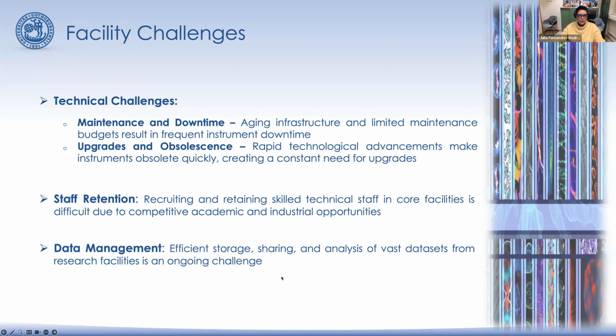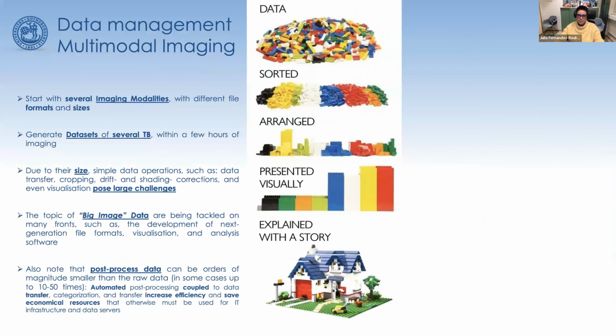Data management, obviously, is the fashionable topic, and it is important for storing, sharing, and analyzing all this data, or big data, that's coming. In my facility, as a multimodal facility, we end up not only with data management for confocal, but with different modalities, different formats, different sizes, and different data sets.